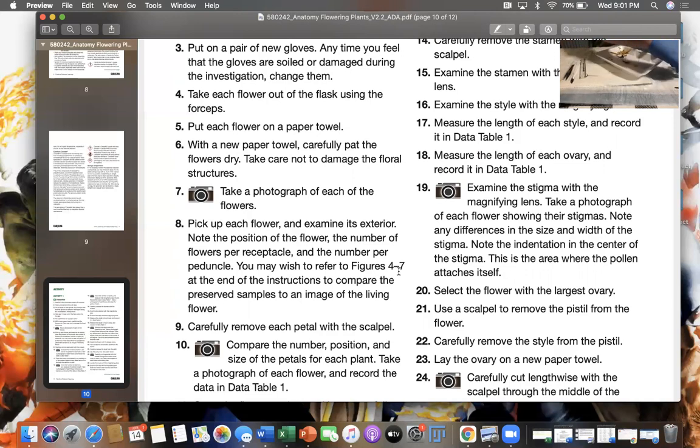So then the daylily is the one that you want to be dissecting for the ovary. So you could cut it out if you wanted to. You could dissect it in there. Let's see, I could get pretty close.